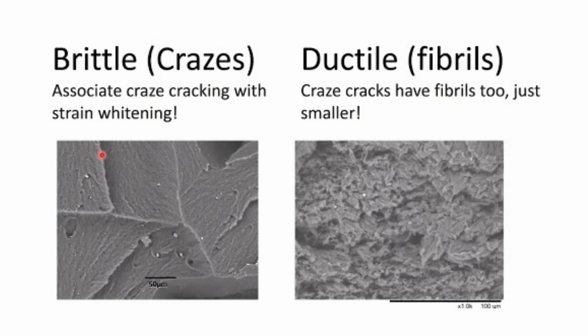Fragmentation of degraded plastics and release of smaller secondary microplastics is usually attributed to the growth of environmental stress cracks. Analysis of crack patterns derived from chemical degradation can be useful not only for assessing the cause of plastic fracture and evaluating the useful lifetime of a product, but it can also potentially provide valuable information on the generation of microplastics.